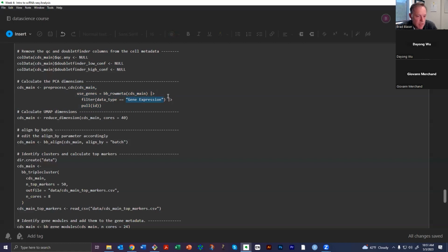So this is strictly based on the gene expression counts. The UMAP calculations are going to be made by this command here. That's going to operate directly on the PCAs that you calculated there. All right, so now you've gone from, say, 30,000 genes to 30 to 50 PCAs down to 2 UMAP dimensions.